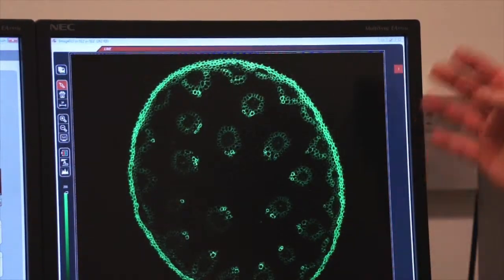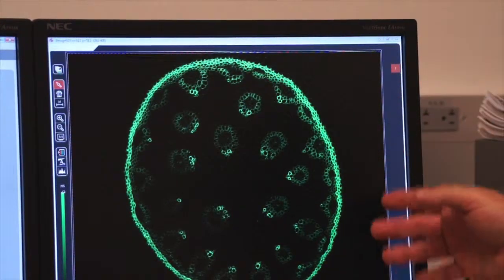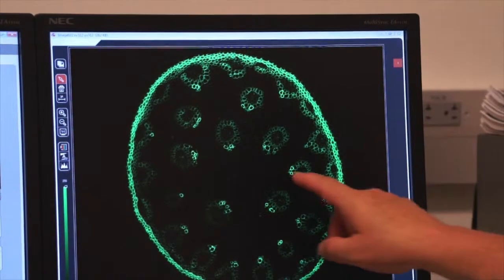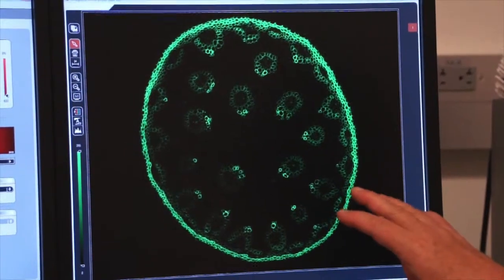And you can see that took a little bit longer. And it is somewhat clearer, but line average tends to work a little bit better for sharpening up your image than does frame average.